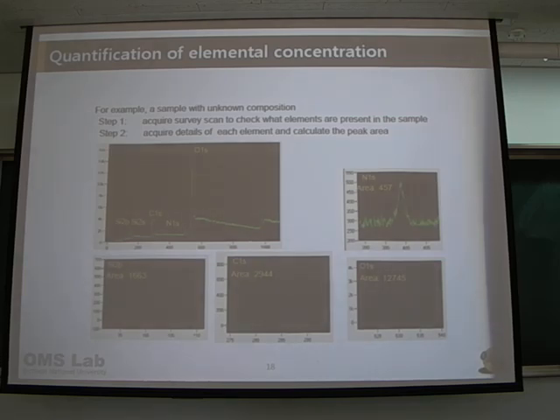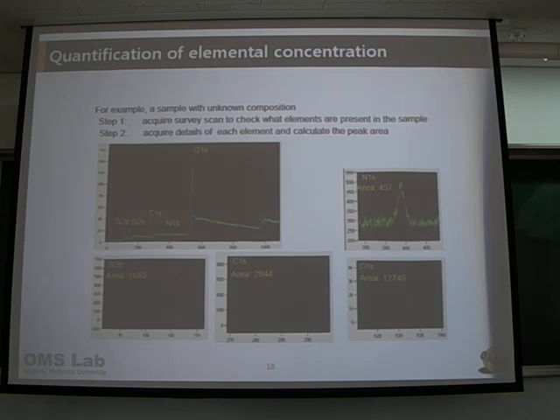This is the energy. How much energy is released? It depends on the energy. Detection of energy. You mean the computer detects the energy? How can we know this is the 1s or 2s or 3s? Yeah. So the computer detects the energy, and from the energy we can know this is the 1s. That means the energy is fixed. The energy for 1s is a specific energy. Depending on the atom, the energy is also fixed. Whether it's from the 1s or 2s or 2p, that already has a certain energy. We know, yeah. Understood?